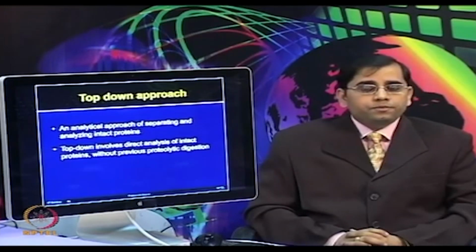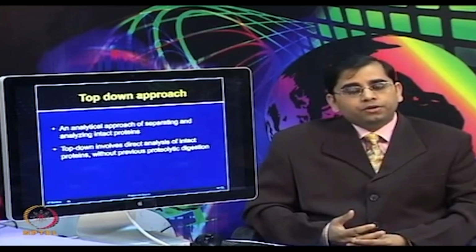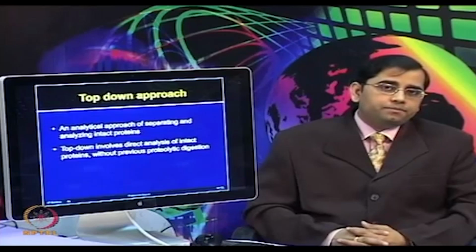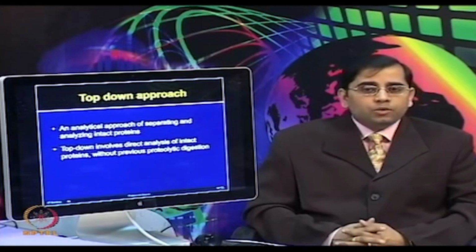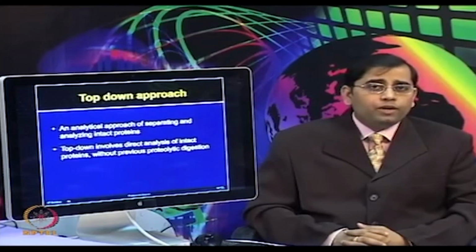The advantage of the top down approach is that it retains information on protein isoforms, sequence and modifications, whereas the disadvantage is that sensitivity and proteome coverage is very limited.